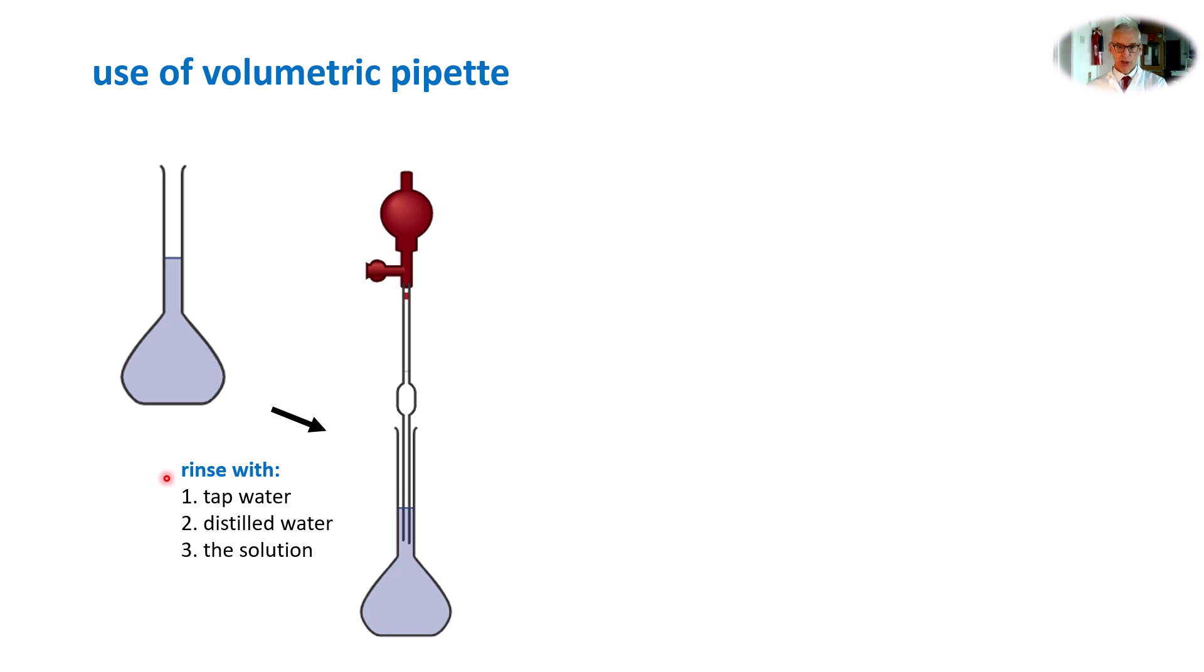The procedure before you use the pipette is to rinse the pipette with tap water, distilled water, and then a little of the solution that is to fill the pipette. That's the same procedure as for rinsing the burette. Having inserted the pipette into your volumetric flask, you'll notice that there is a graduation mark at the volume printed on the pipette. In this case, I'm assuming it is 25 centimeters cubed. We're going to fill the pipette up to the graduation mark on the pipette, bottom of the meniscus as previously.